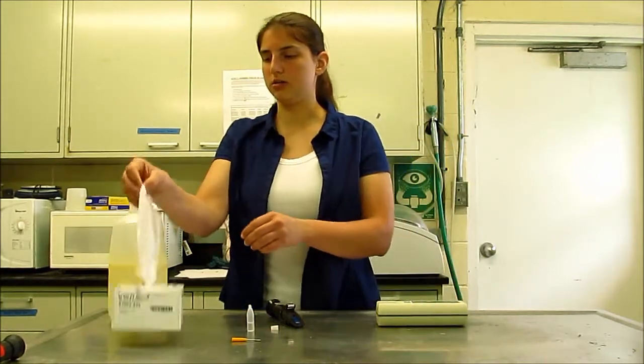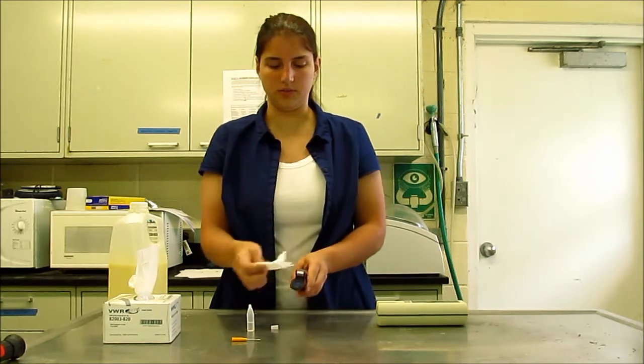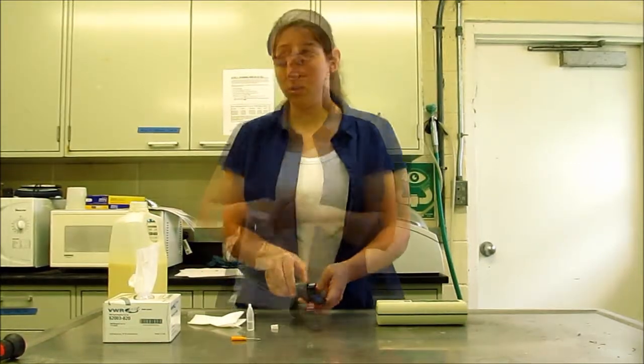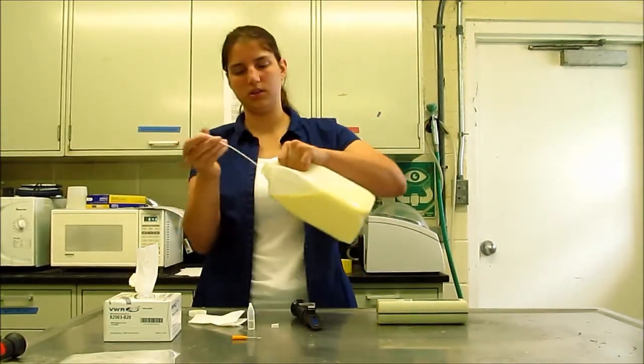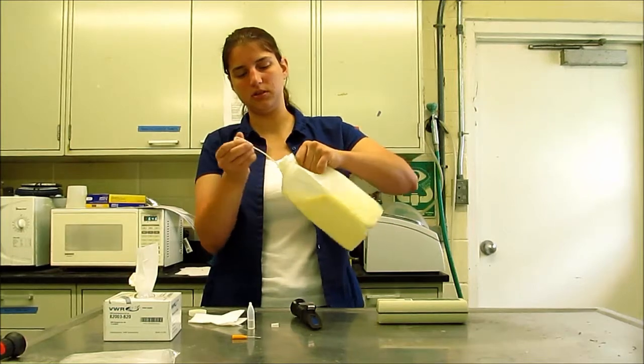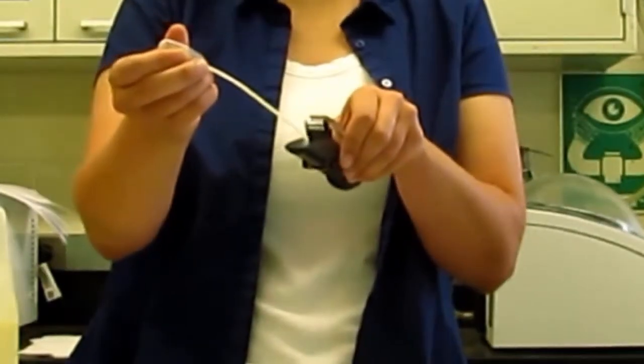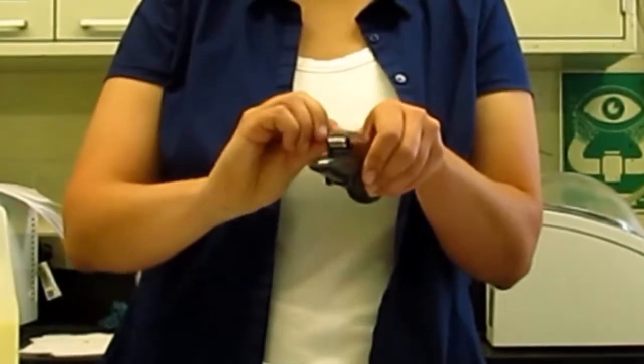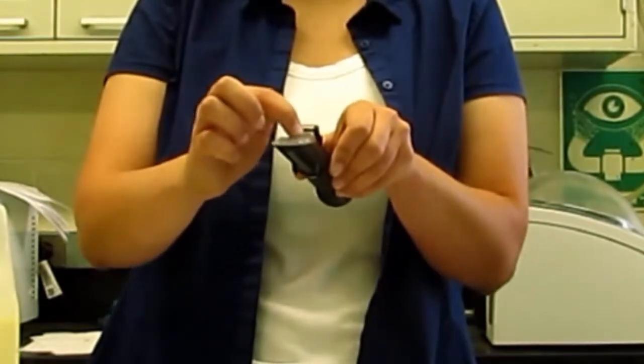To measure an actual colostrum sample, first we'll wipe off the water from our calibration. Then, using a small pipette, we're going to put just a couple drops of the colostrum right on the surface of the refractometer, just like we did with the water, and then flip the cover down to spread it out so that it covers most of that surface.